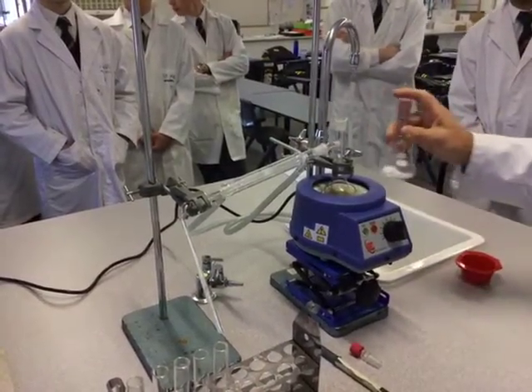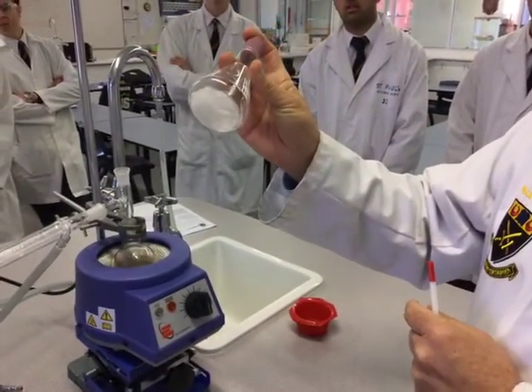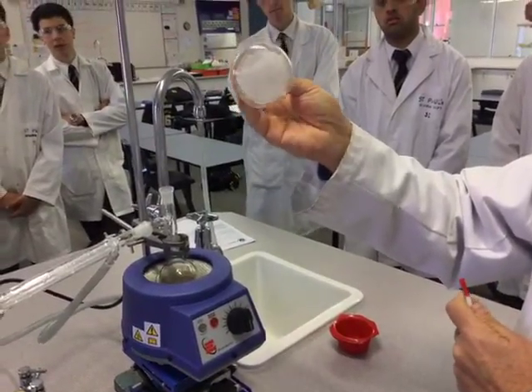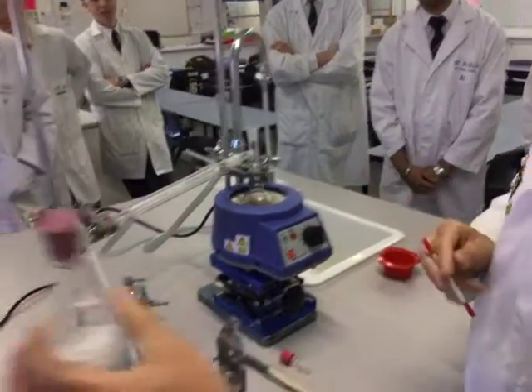We're ready to put into the round bottom flask our ESTA product. That tells us that most of the water has been taken up by the calcium chloride, and that's what we were trying to observe — that's what we're after.